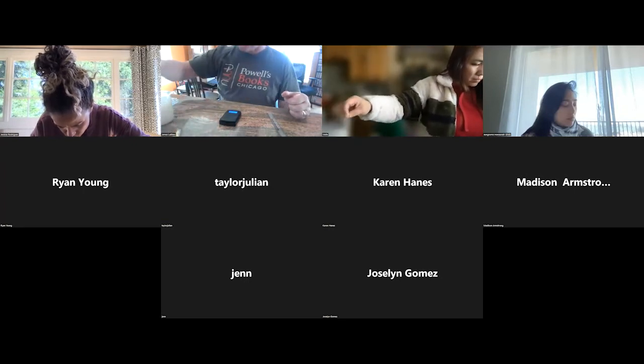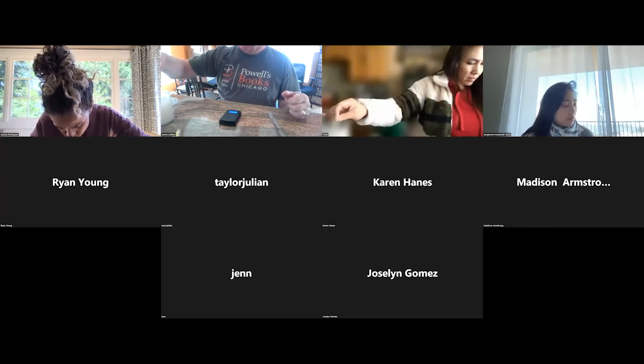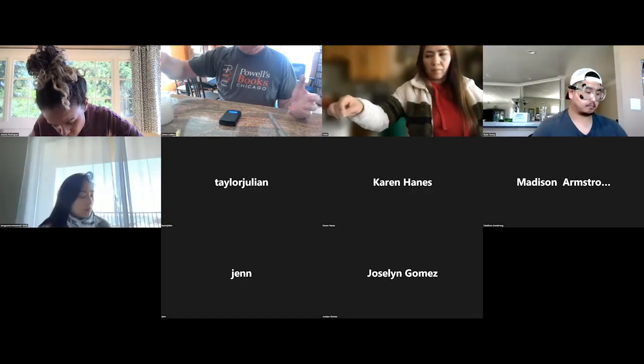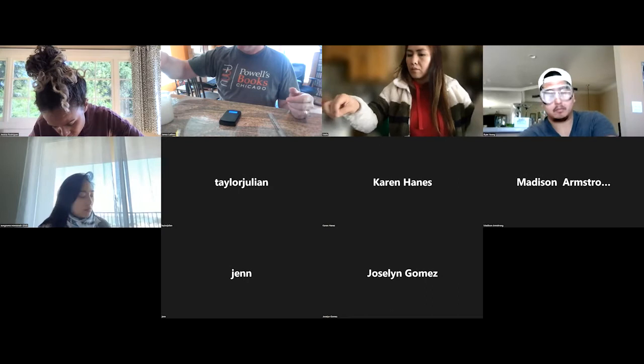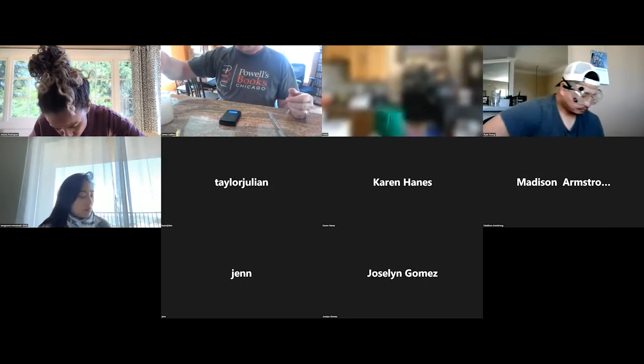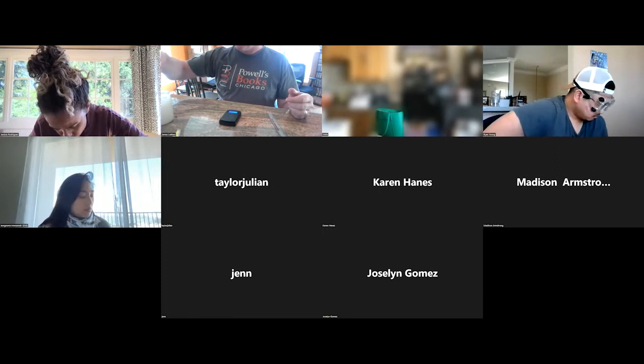It doesn't really say. Basically, you just keep stirring it until all the yeast is suspended. Obviously, the yeast aren't going to dissolve. So you want a fairly even suspension.